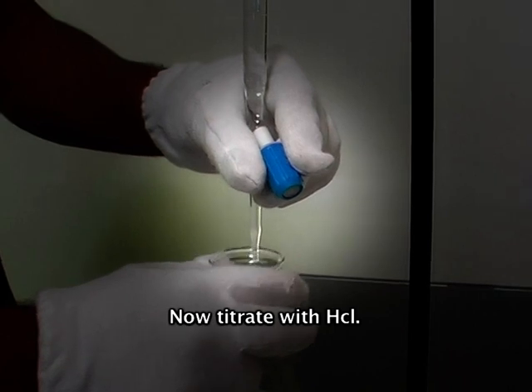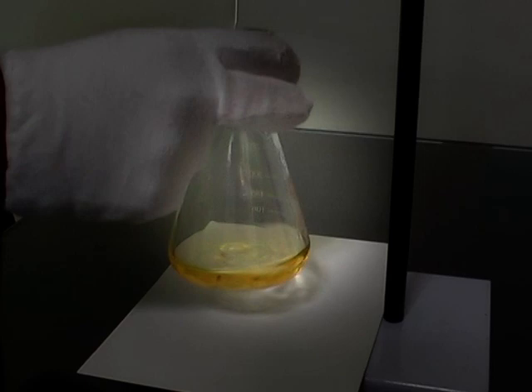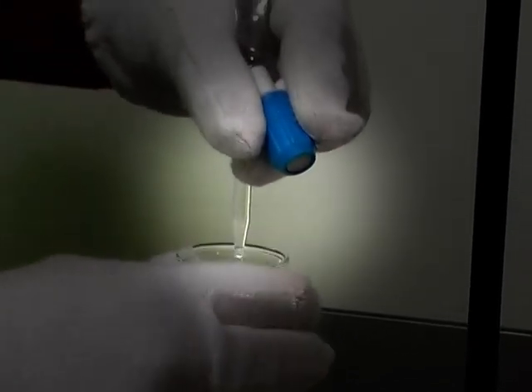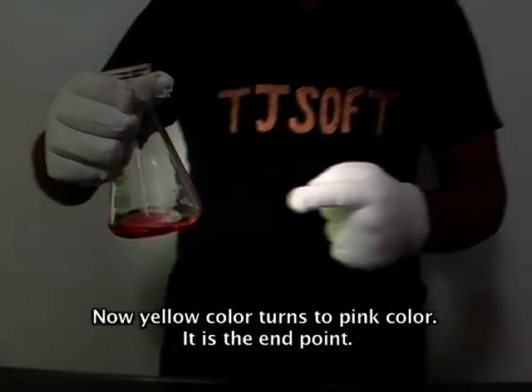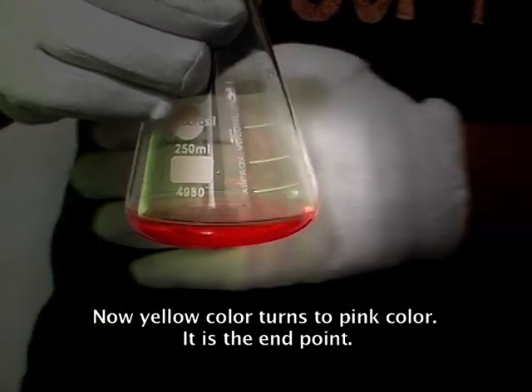Now, titrate with HCl. The conical flask is constantly shaken until the color changes. Now, the yellow color turns to pink color. It is the end point.